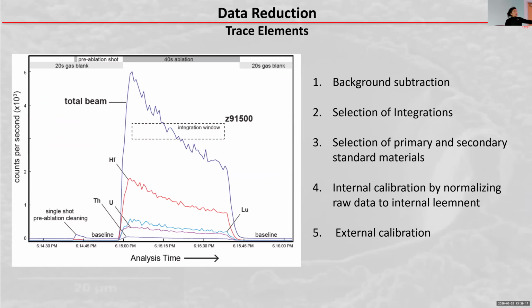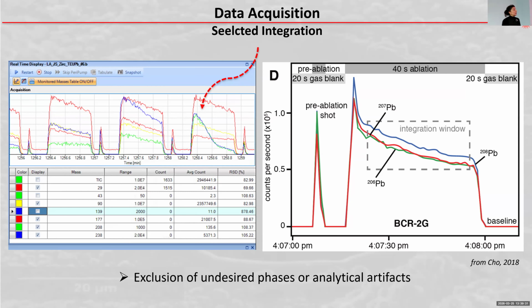What you need to do, in a very strict protocol, is subtract the baseline. And that sounds trivial. And you say, well, the gas, it's helium. What should there be anyway? But you have to be careful, because it's an ICP-MS. The Achilles heel of the ICP-MS is the interference, because it's a curse and a bliss. It can ionize everything, so it just produces everything.